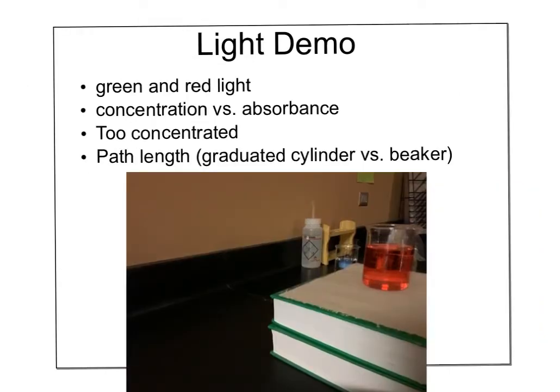All right, a couple other things to show you. So I have a red liquid here, and I want to show you why we have to use the complementary colors. So here's green light, which is complementary to red. I'm not pointing it through the beaker yet. So look at how bright that is on the wall. Now when I go through the beaker, here it is after it's been absorbed by some of the red particles. So you can see there's clearly some of the light getting absorbed, big difference.